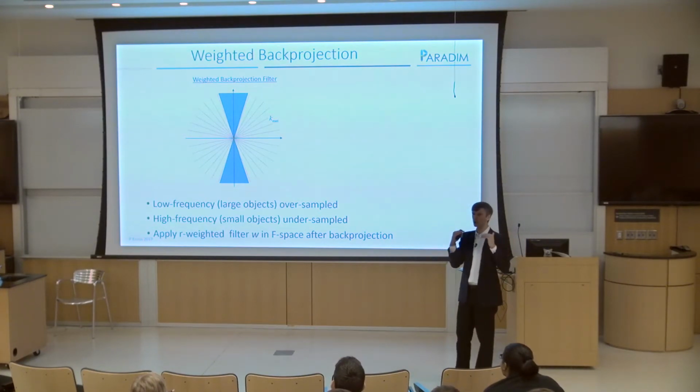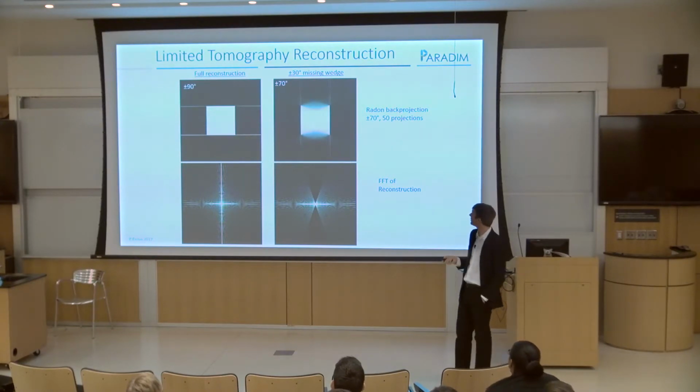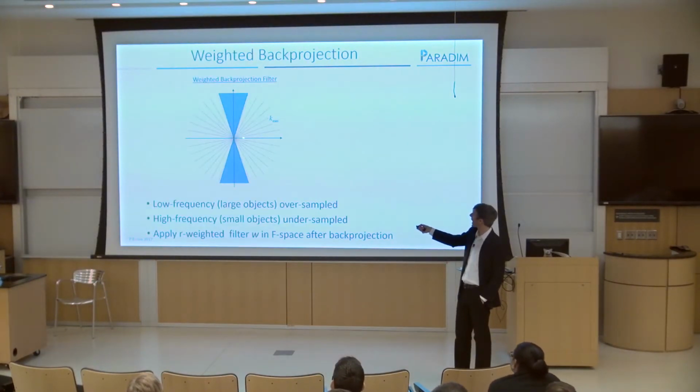Those are things that are not sharp. Those are things that are blurry. And you can see that we're missing a lot. This becomes very blurry, right? That's a really hard edge, so that's difficult to reconstruct. So what happens is we oversample things down here at low frequencies, and we undersample things at the high frequencies.